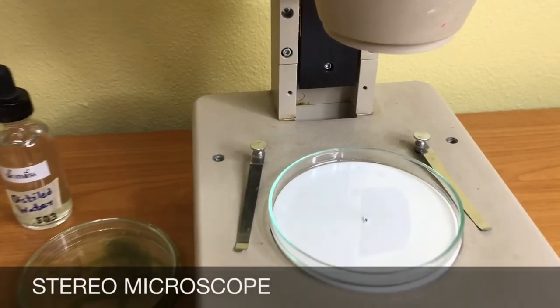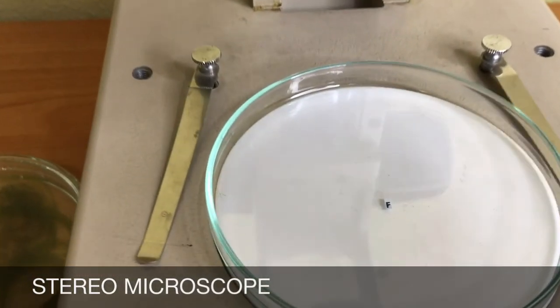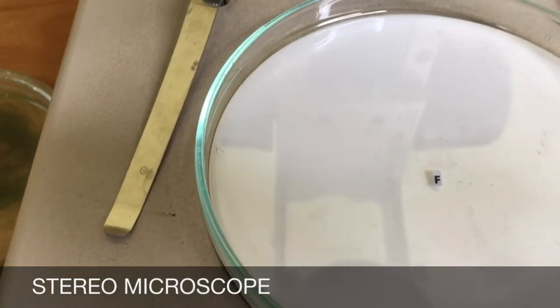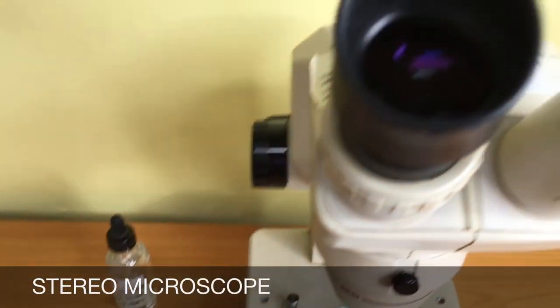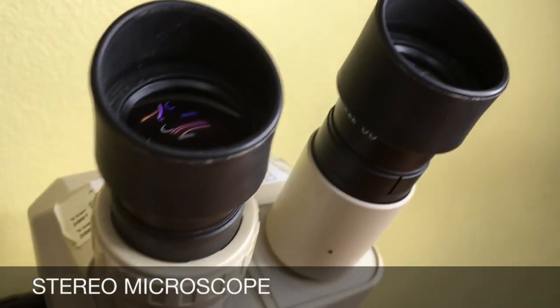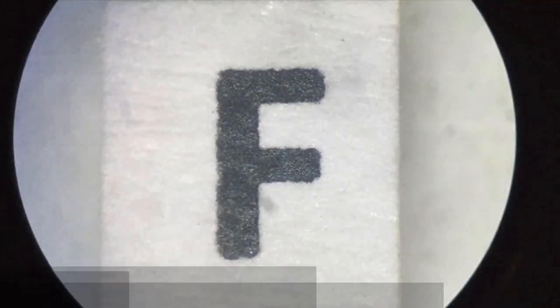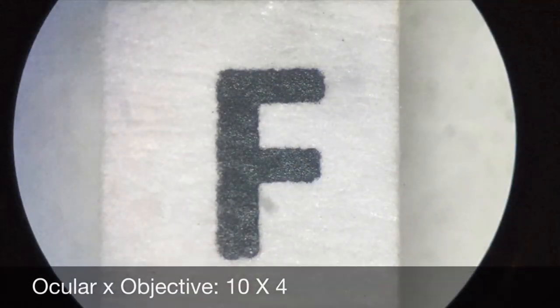Next, let's see the letter F under the stereo microscope. Please note that we use tenfold magnification of the ocular lens and the fourfold magnification of the objective lens.